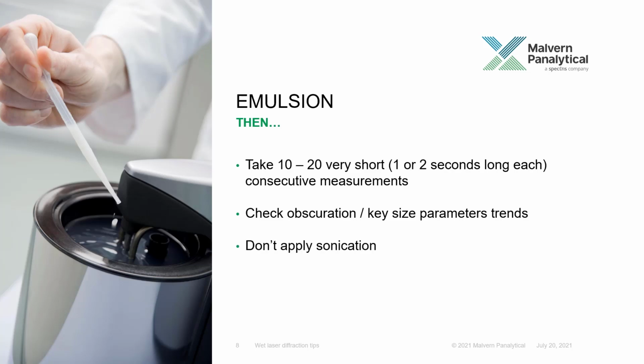If poor stability is observed, that means that the emulsion is changing due to the dispersion liquid. It is best to measure it in the mother liquor, which can be obtained by centrifugation or recreated based on the original emulsion recipe. For example, in an oil and water emulsion, the mother liquor is everything in the emulsion but the oil.